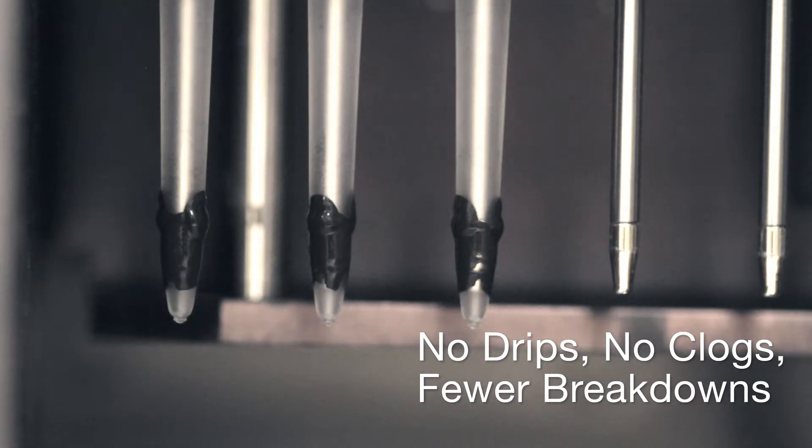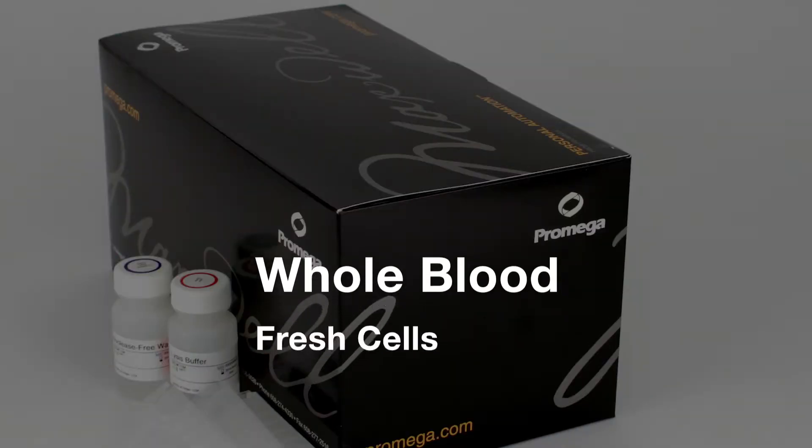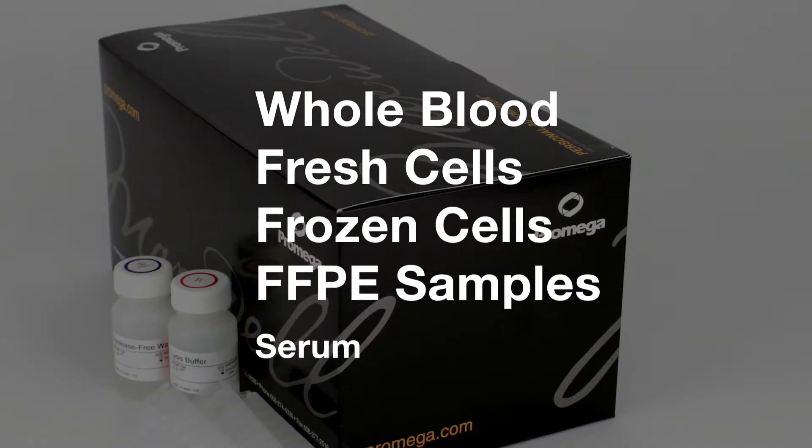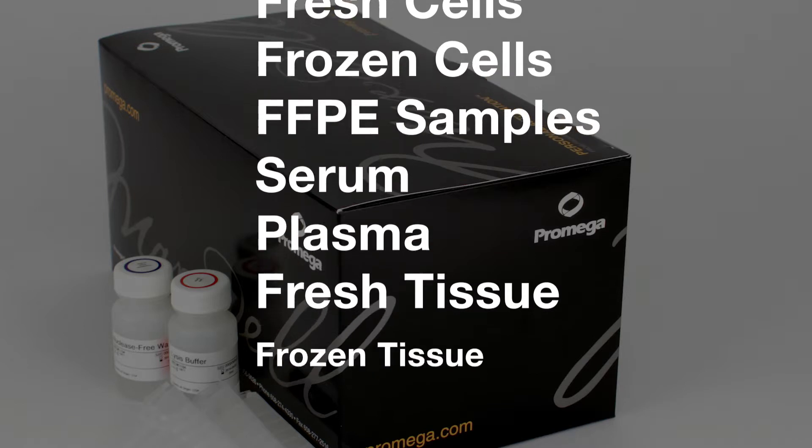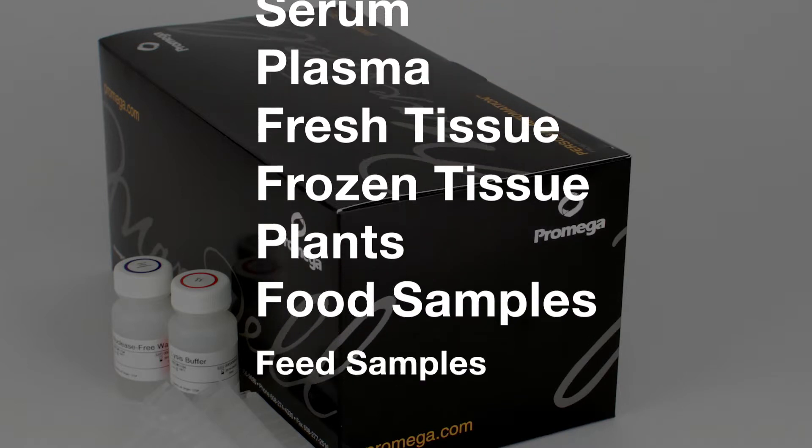What that means for you is no detectable cross-contamination and fewer interruptions to your workflow. Purify DNA or RNA from a variety of sample types with optimized purification kits, all on one instrument.